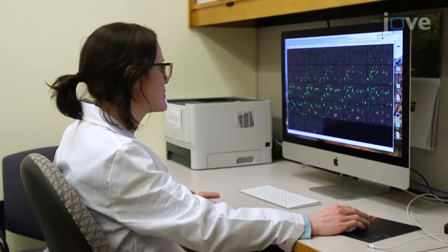This method tracks structures in yeast cells in 3 dimensions over many minutes, allowing us to study the dynamics of intracellular organelles and compartments. 4D imaging ensures that we can draw reliable conclusions about intracellular dynamics, particularly for structures or markers that may be transient. Demonstrating the procedure will be Natalie Johnson, a postdoc from my laboratory.